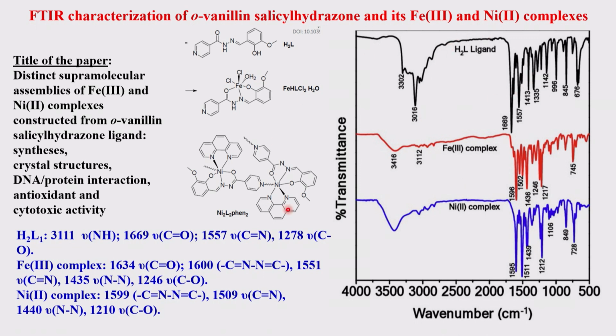And if you look at the infrared spectrum, the first impression you get is a comparison of the ligand spectrum versus that of the complex spectrum, and you can say that the complex is formed or not formed. Whether it is iron or nickel can also be told from the color, followed by the bands that are coming up. This has got bound water, bound halide, so the bound water bands can be seen. Here also there is some bound water, and you have other CH vibrations too. CH comes mostly from the sp2 region.